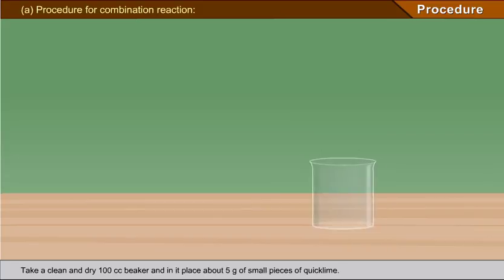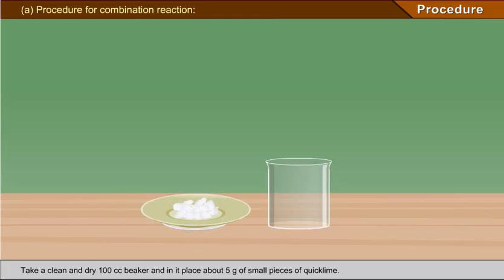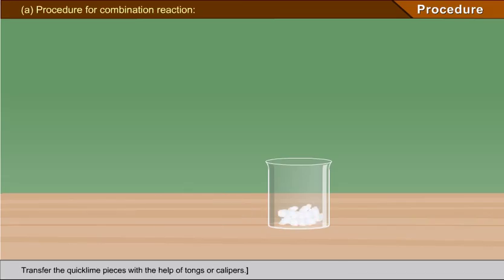Procedure for combination reaction: Take a clean and dry 100 cc beaker. Place about 5 grams of small pieces of quicklime. Caution: Do not lift quicklime pieces with bare or wet hands. It can cause severe skin burns. Transfer the quicklime pieces with the help of tongs or calipers.